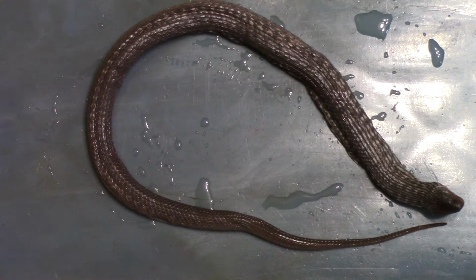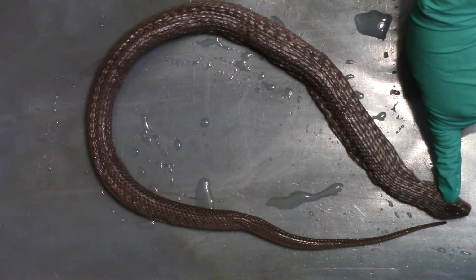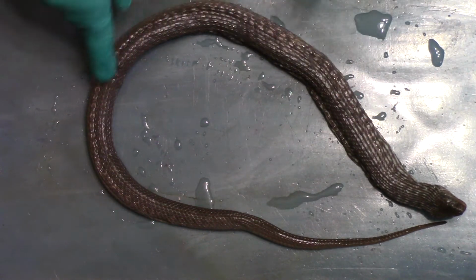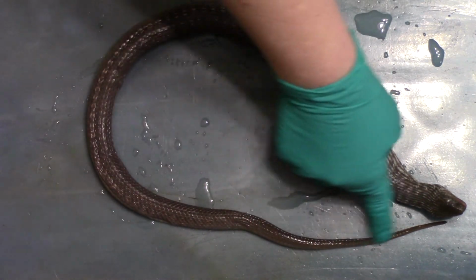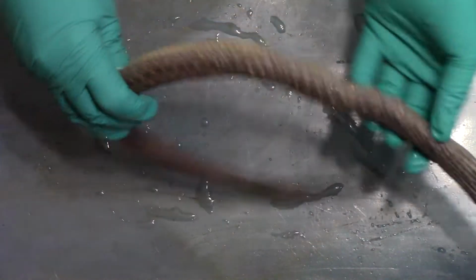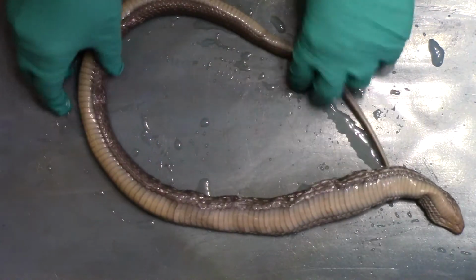Here is my preserved snake specimen. The external anatomy of a snake is pretty simple. You have the head, the neck, the entire body, and then the tail. How you tell where these are is with a little bit of closer examination.